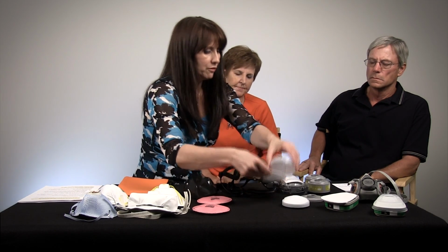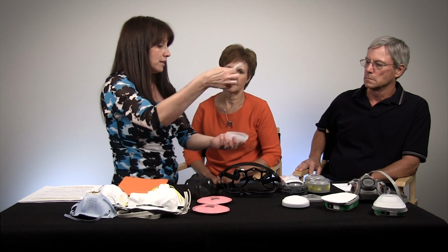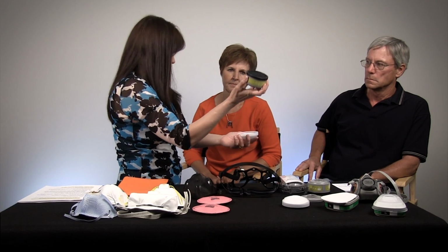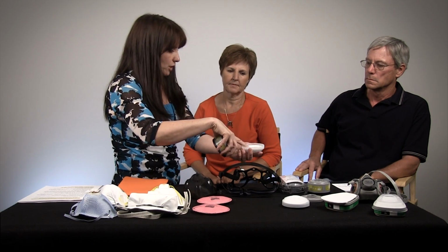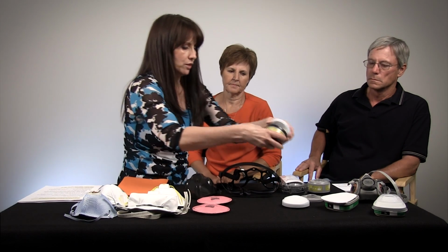Also, you see we have a pre-filter. This helps to filter out the particulates. So these pre-filters can be replaced several times before you have to replace the cartridge. So this is the first thing you do, replace the pre-filter, and then when necessary, replace the cartridge.